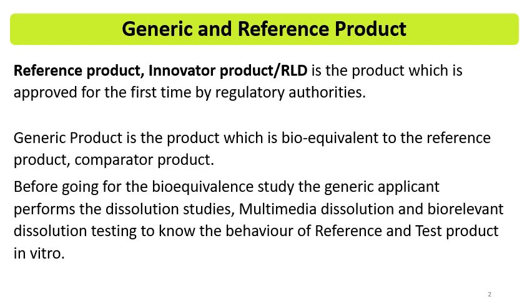Before going to the bioequivalence study for a generic product, the generic applicant performs the dissolution studies, including multimedia dissolution and bio-relevant dissolution testing as per the product requirement. These tests are done to know the behavior of the reference and the test product in vitro.